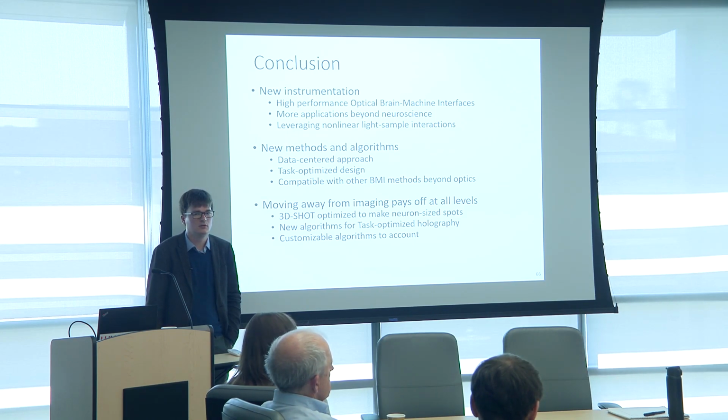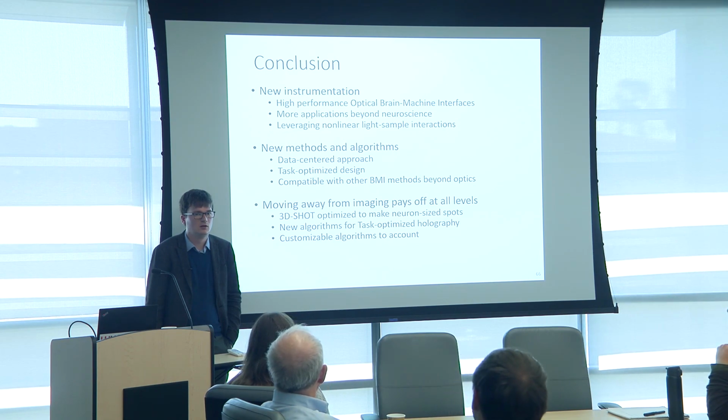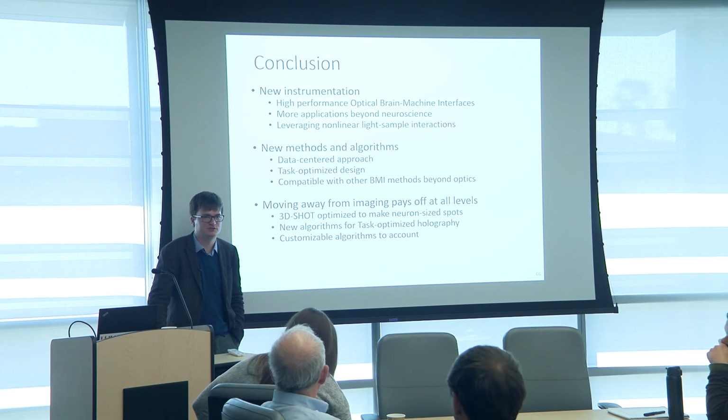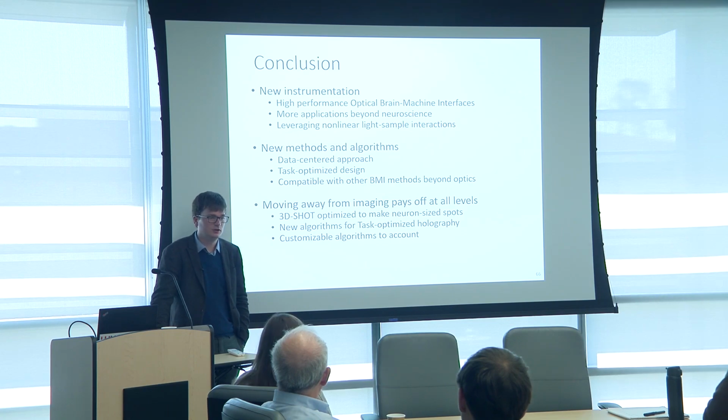So since sometimes we get it, particularly with photostimulation, you get into power limited regimes, what are some common efficiencies that you get out of your system, diffraction efficiencies that you get out of your SLMs? Diffraction efficiency of the SLM is whatever the manufacturer gives you. So it's like between 80 and 95%, depending on how much money you spend. When you get to faster SLMs or SLM with smaller pixels, that can go down. Also older technology that's typically not as good.